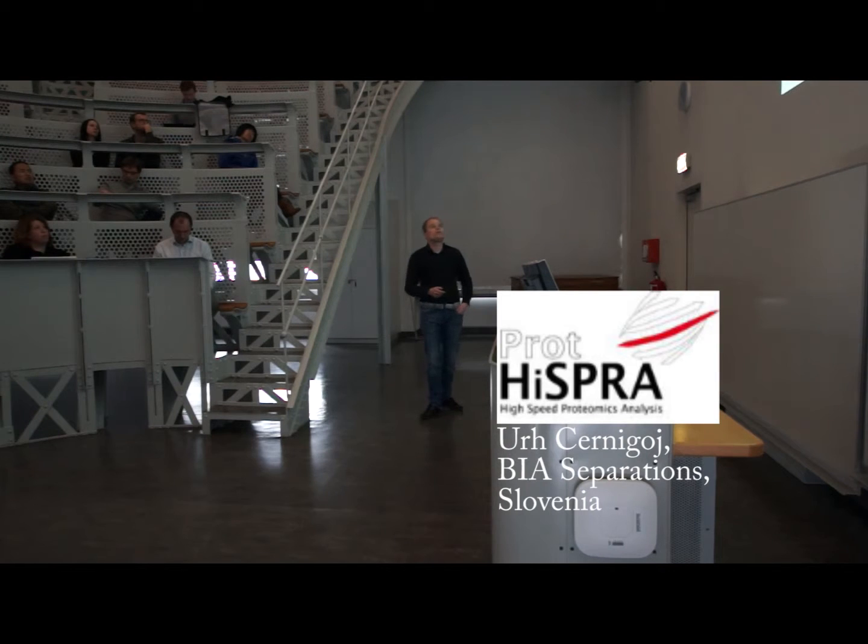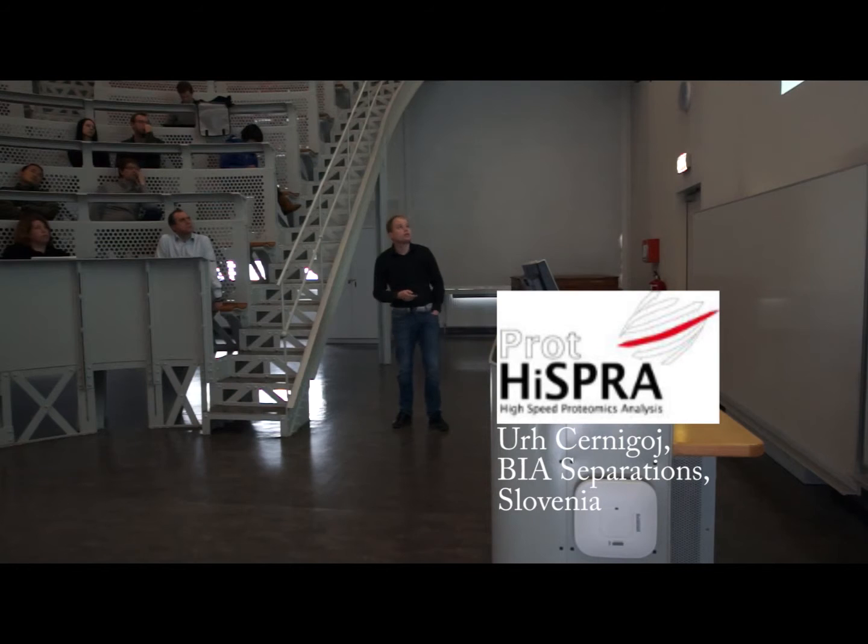And then, just to prove that we really succeeded, we did some characterization. This is, for example, the IR spectrum. Actually, the green one is the IR spectrum of the pure titanium dioxide, and the black one is the organic matrix, the monolith, and you can see this small increase of the red compared to the black one. This is then a proof in this case that the titanium dioxide is there.